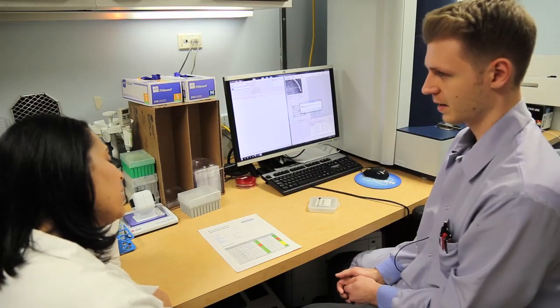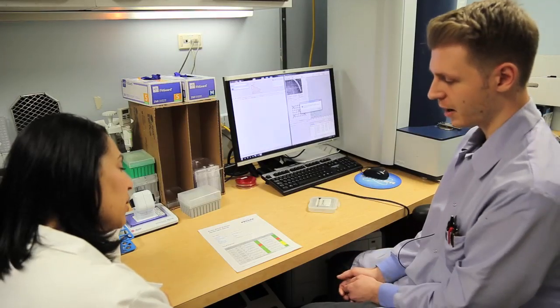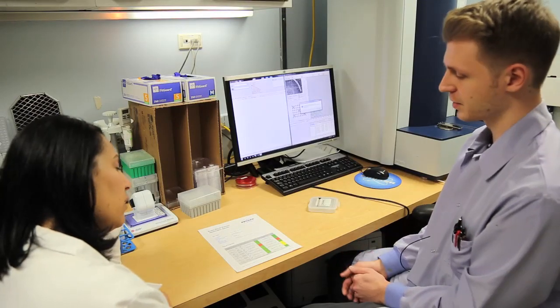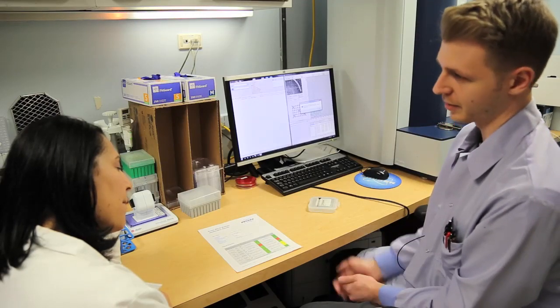Okay, so that's the second one. But you would feel comfortable saying it's most likely? Yeah, and actually if we were in the program, we could look and see the top 10 and compare those. Okay. And so we don't have it in front of us, but there's a good chance they were also hemolyticus.